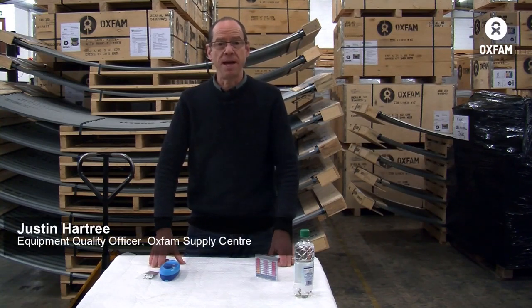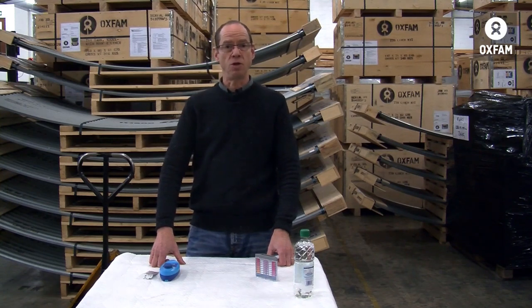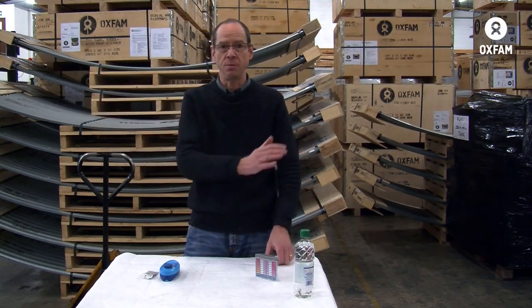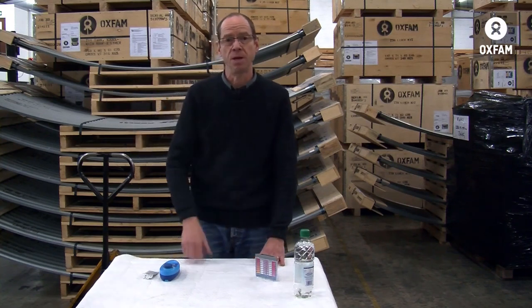I'm going to talk a little today about measuring of chlorine in water samples, particularly residual chlorine. Residual chlorine, we know, is something we have to measure at any point in a water treatment process. We know when you're doing water trucking, for example, you want a residual that's much higher than at the point where you're delivering to the beneficiary. So we need to be able to measure the amount at different points in your system.